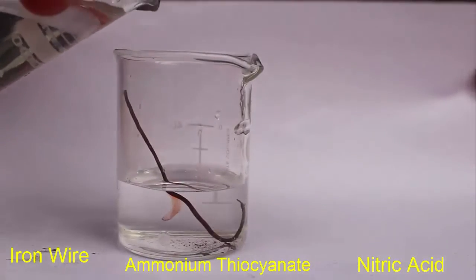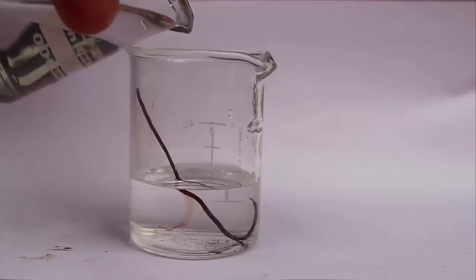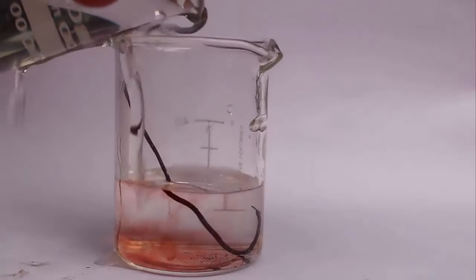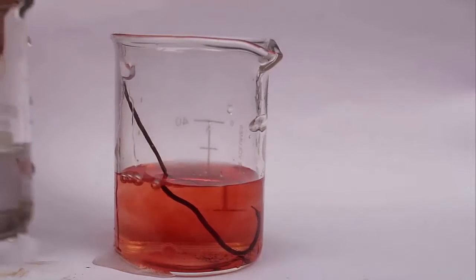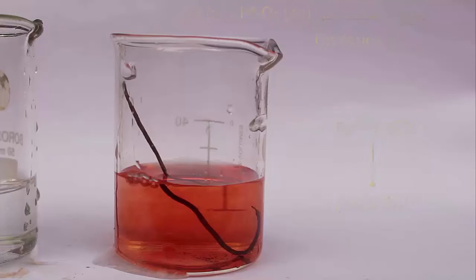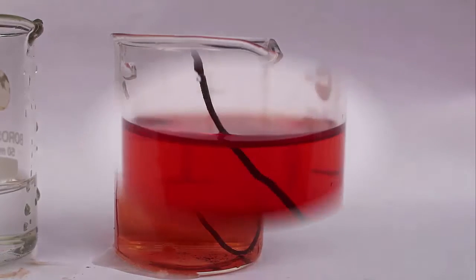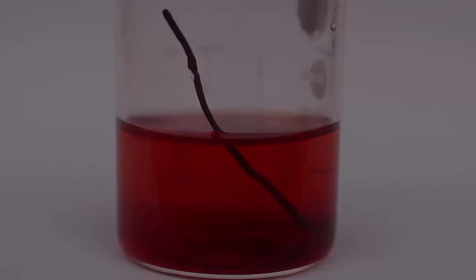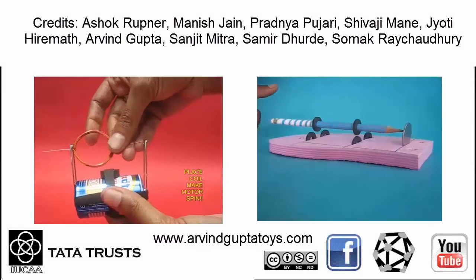Place the iron wire in the ammonium thiocyanate solution, and when adding a few drops of nitric acid you will see a blood-red color leach out of the iron wire. This chemical reaction can aptly be called the bleeding of iron wire. The complex reaction between thiocyanate and iron leads to this very beautiful red color.